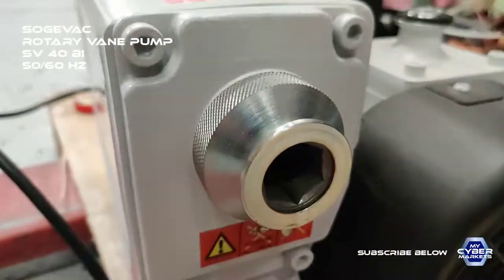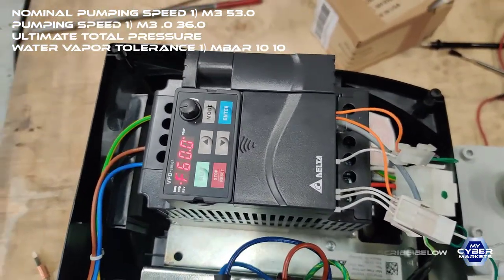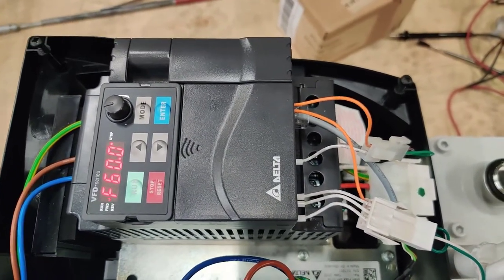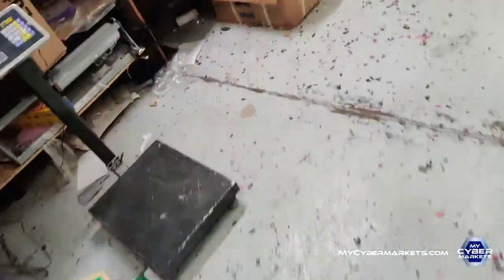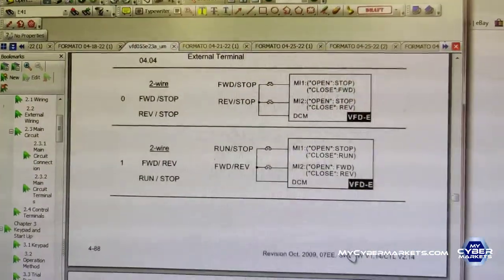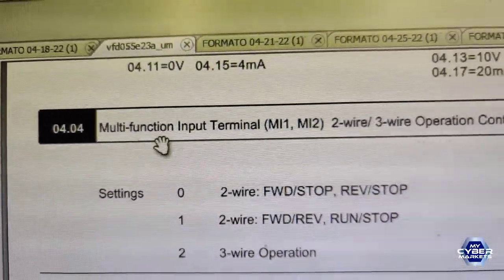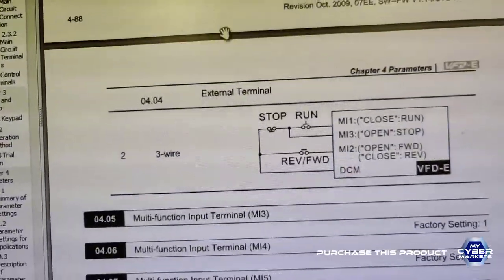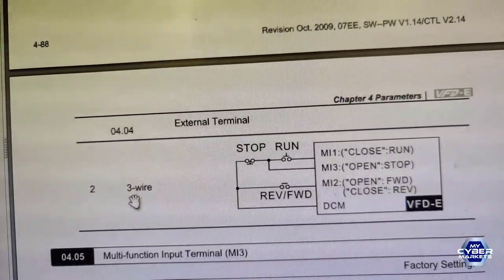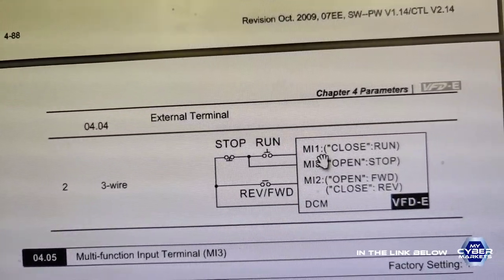We actually received this servo drive and it had the wrong configuration, and that's why it didn't start. So what we did is we looked at the manual, and parameter 404 must match the correct configuration — the three-wire configuration with MI3 and MI1 together and DCM.